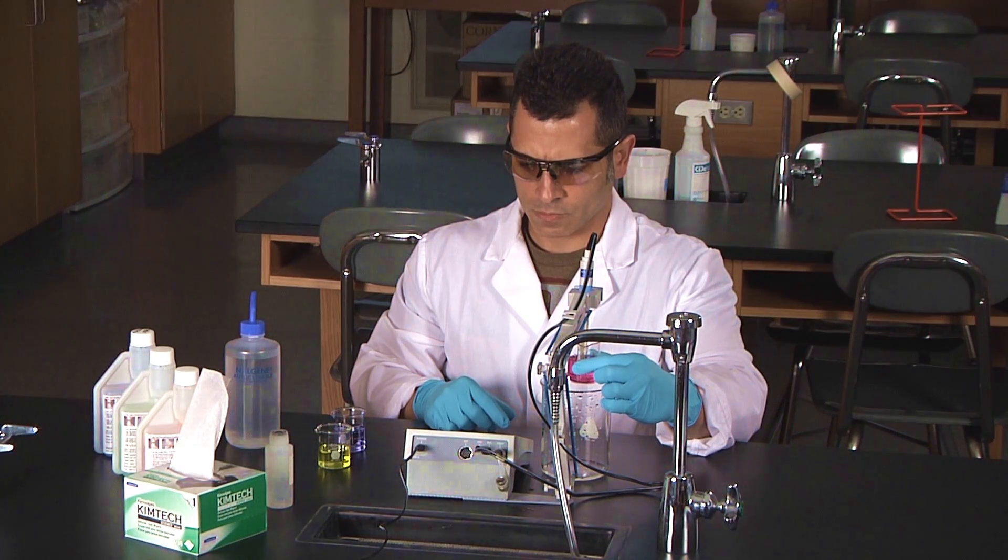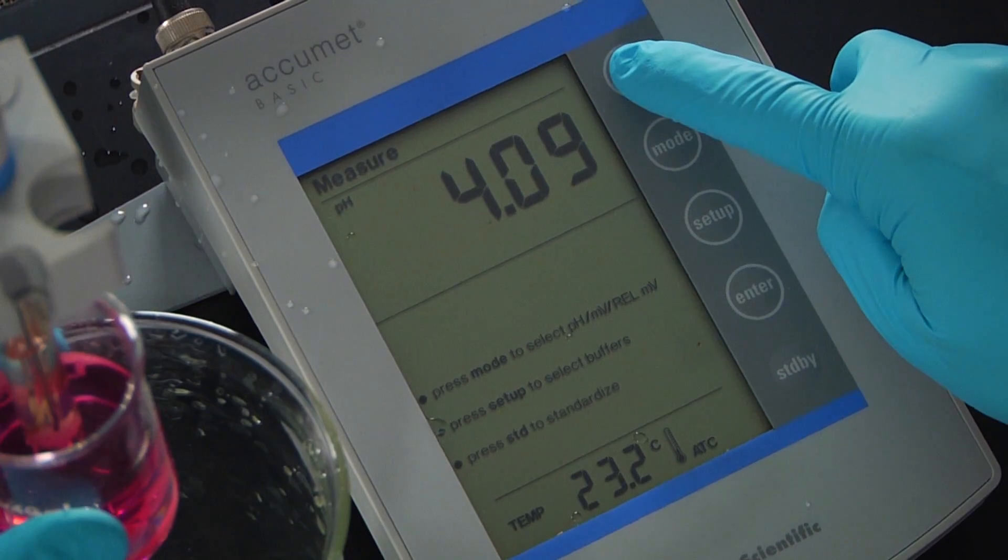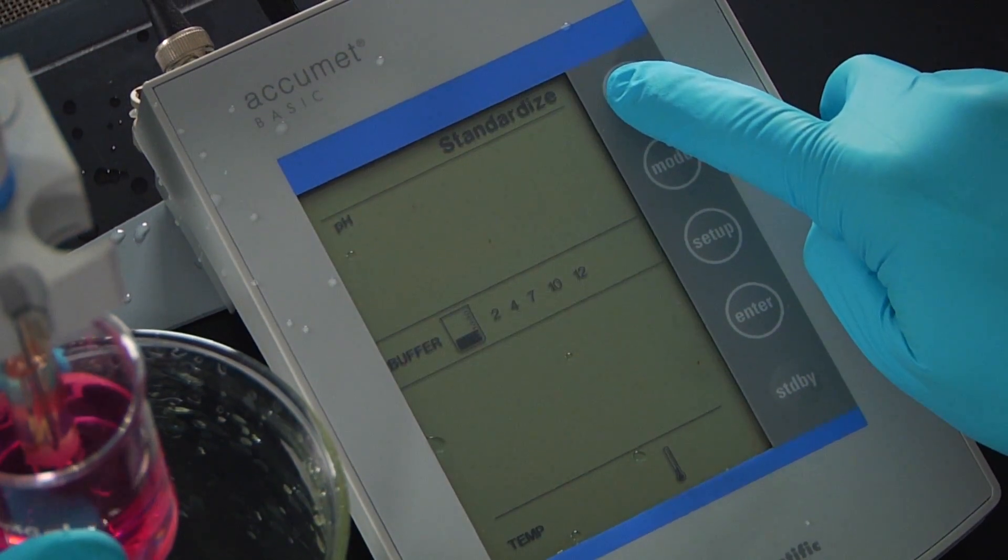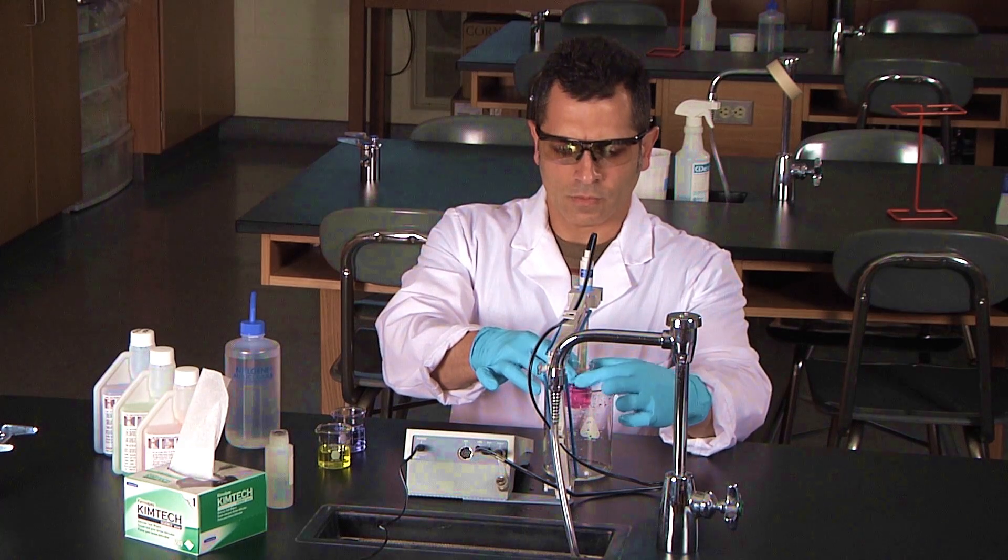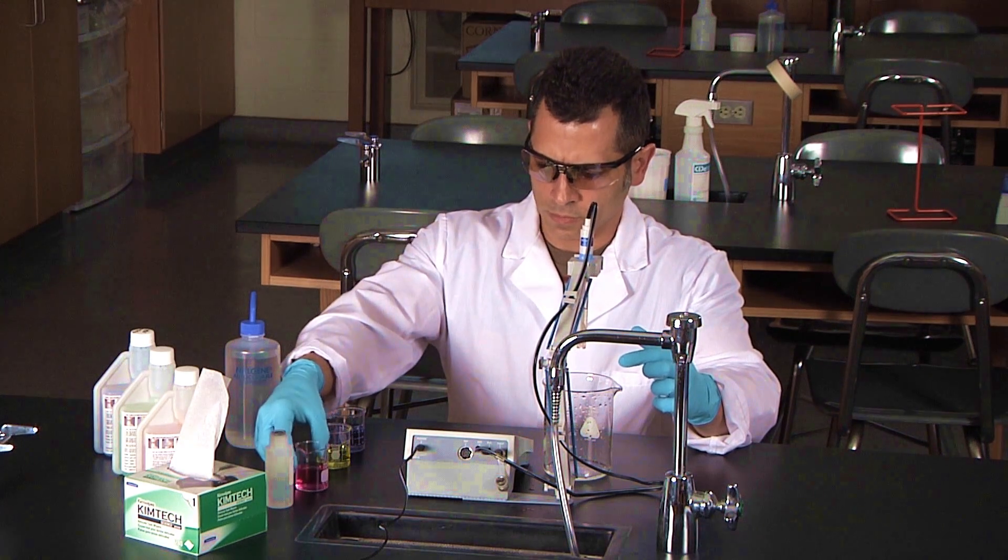Once the stable icon appears, press the standardized key. The display on the pH meter should read 4.00, but a range of plus or minus 0.05 is acceptable.